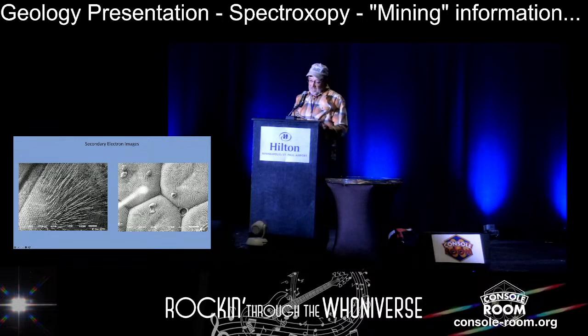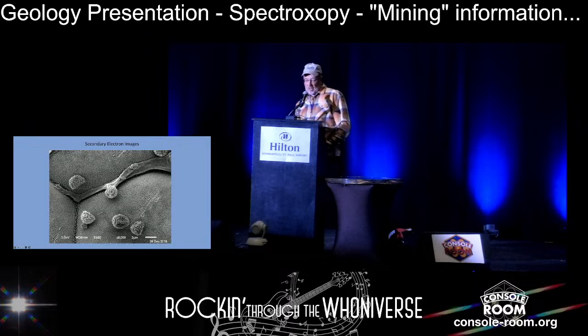The little dots were interesting to me. I had seen that and expected it. And if you look carefully, there was a fungus growing that was actually degrading this particular dead butterfly. That was a surprise. But again, you never know what you're actually going to see.